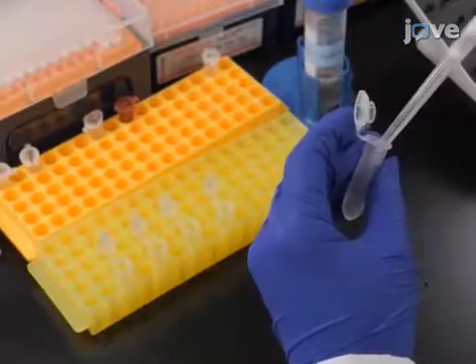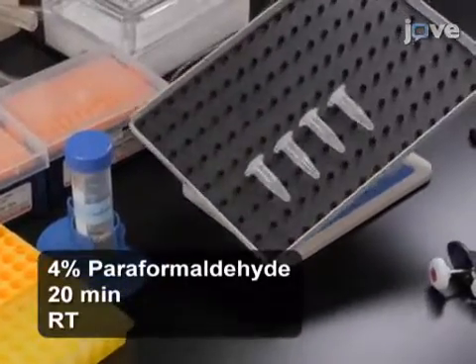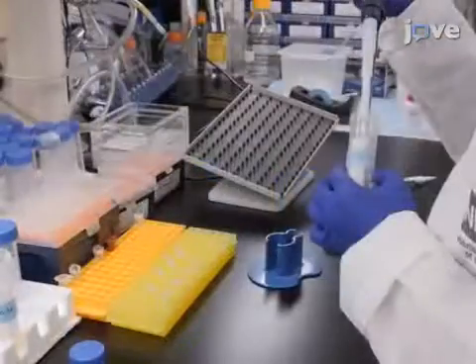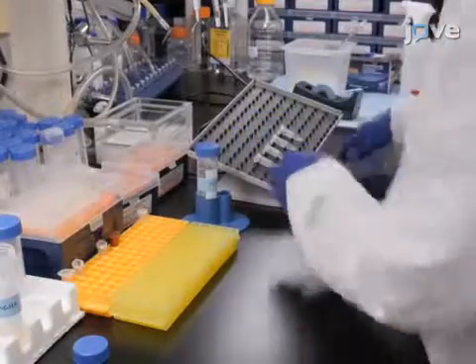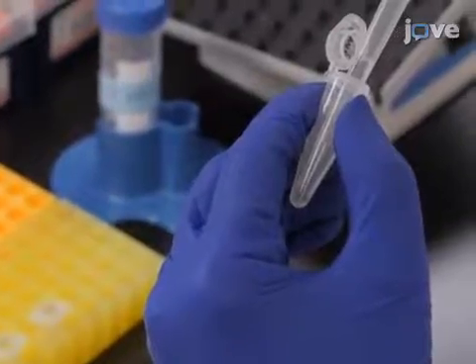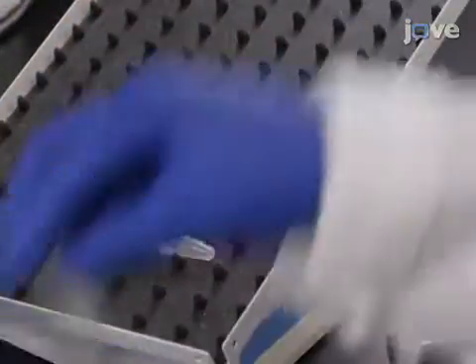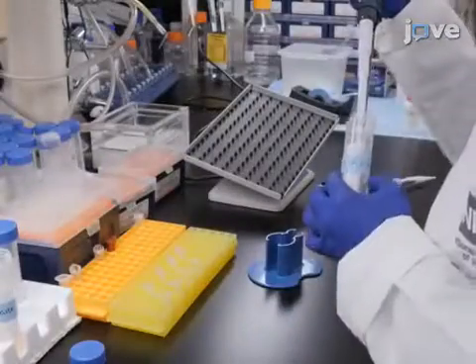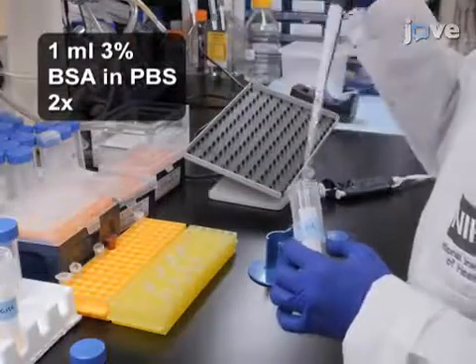To fix the tissue, first incubate the ovaries in 4% paraformaldehyde for 20 minutes at room temperature with gentle rotation. Then, remove the fixative and wash the tissue twice in 1 milliliter of 3% BSA in PBS for 5 minutes each time with rotation. For permeabilization, remove the wash solution, add 1 milliliter of 0.5% Triton X-100 in PBS, and then incubate the ovaries at room temperature for 20 minutes with rotation. Finally, remove this solution and wash the tissue twice in 1 milliliter of 3% BSA in PBS.